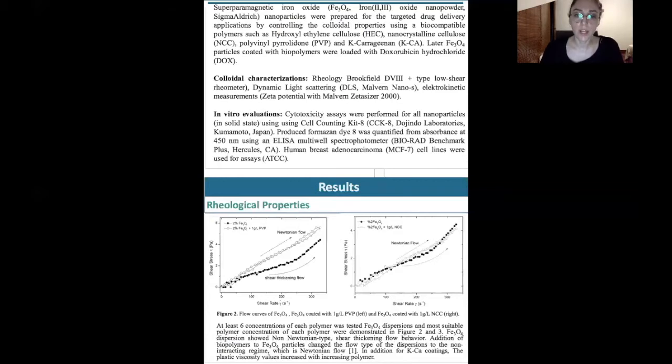Here in the first two graphs on the left-hand side, we can see the difference between uncoated iron oxide nanoparticle and the coated iron oxide nanoparticle. Uncoated iron oxide nanoparticles show shear thickening flow behavior, but when coated with polymers at one gram per liter concentration, the flow converted into a Newtonian flow. This was also seen in all the other polymers we used.